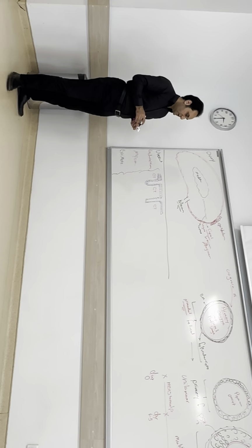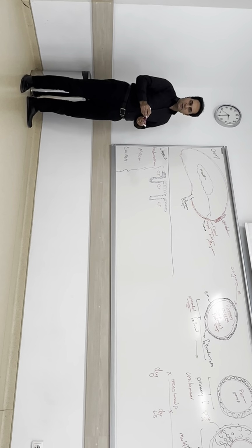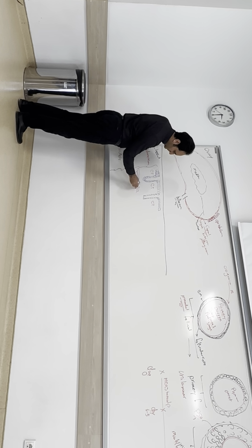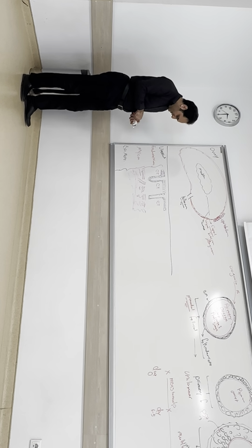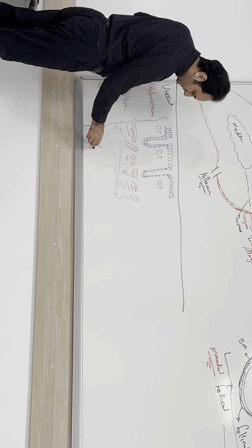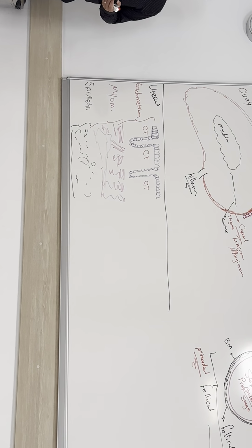Nourishment of the embryo in the first 2 weeks. Under the endometrium, we have a thick layer of smooth muscles, present in different directions in this part. This part is our thick area of myometrium. And here we have loose connective tissue again, surrounded with the mesothelium, known as the epimetrium or perimetrium.